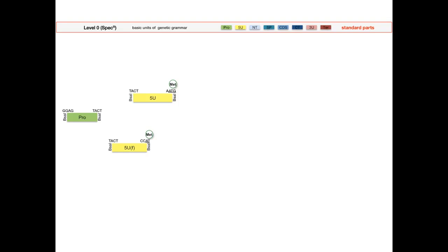As the end of the 5' untranslated leader defines the start of translation, these overhangs contain all or part of the ATG codon for methionine, making the join as close to seamless as possible while still retaining modularity. N-terminal tag modules start CCAT and end AATG in order to join to coding sequence or CDS modules.